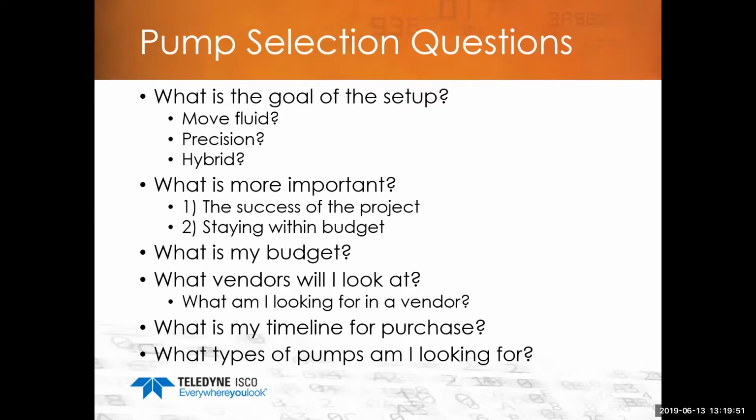First, we want to understand what's the goal of the setup. Do you need to be just moving fluid? That's a different type. That's one mindset to decide your technology. Precision. When you hear precision, I talked about 4 types of technologies, and which one stood out? That's correct. Syringe pumps. Or a hybrid, if you use a few different types in the same application. So you need to understand that goal.